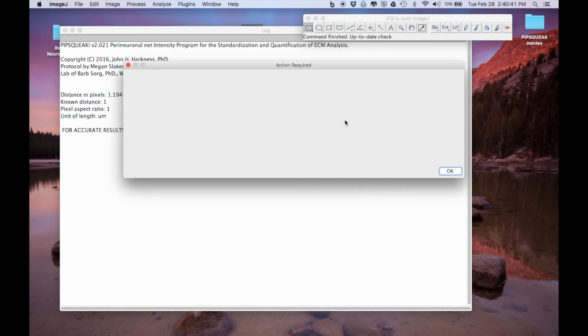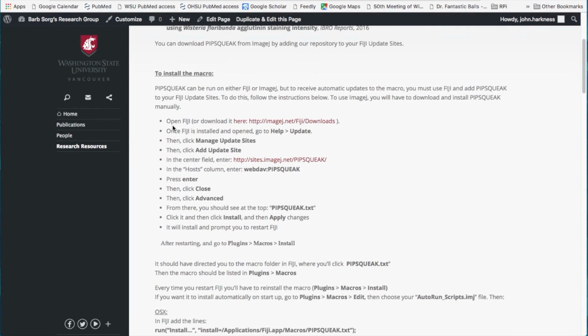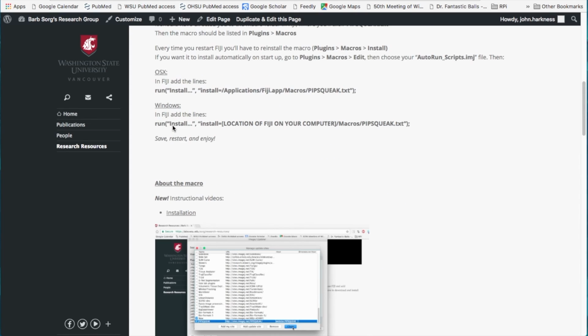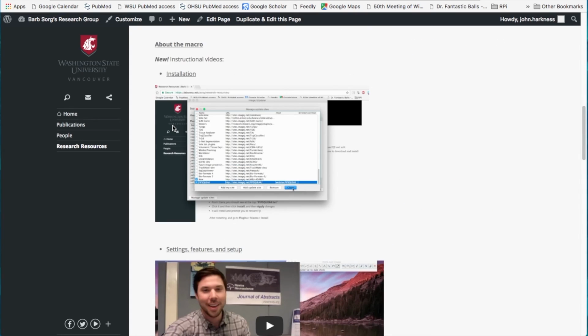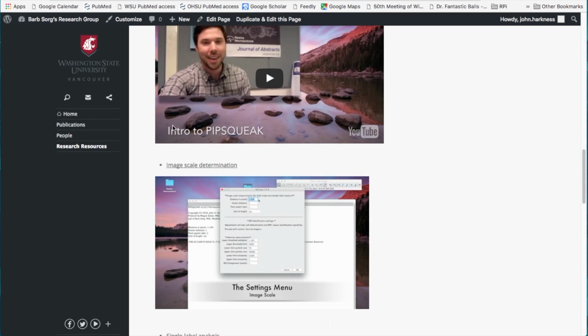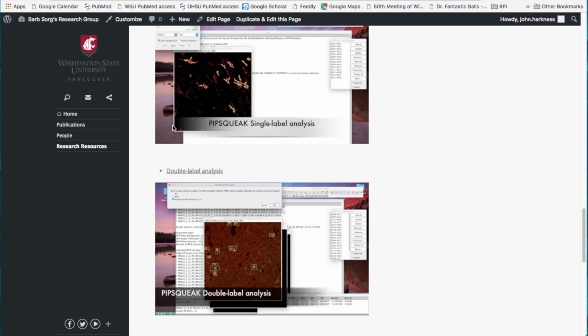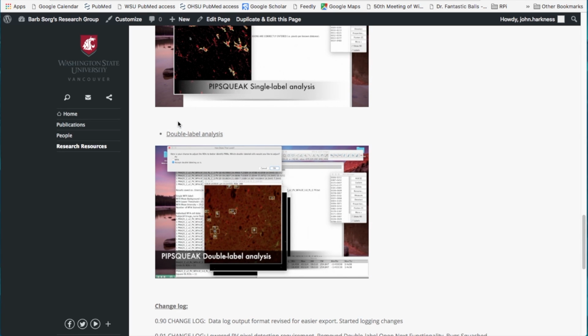And so that's the end of this tutorial. If you want to know more about the other settings and features of Pipsqueak, you can check out the intro and settings video. I also have some good tutorials on how to do single and double label analysis that you can find back at the labs.wsu.edu/sorg website.